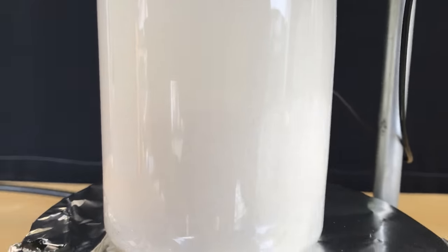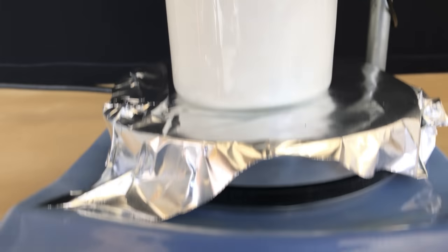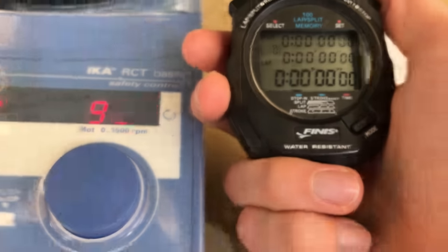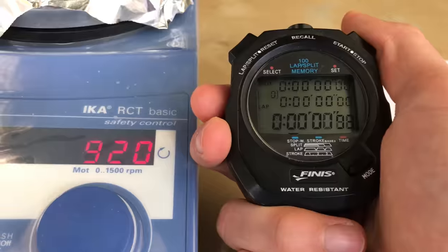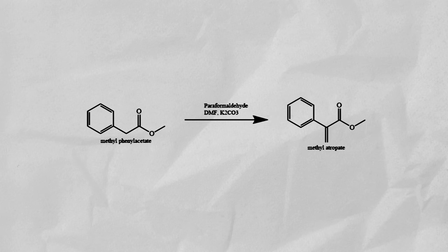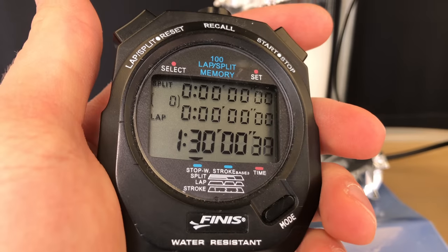Once we began stirring, the pink color quickly faded away. Stirring is crucial as the potassium carbonate will not dissolve, and to increase the efficiency of the reaction, we need a nicely uniform suspension. The reaction taking place can be seen here. Methyl phenyl acetate is converted to methyl atropate. The paper I was following can be found in the video description. It was originally meant for ethyl atropate, but it should also work here.